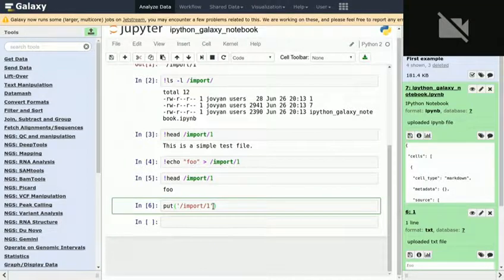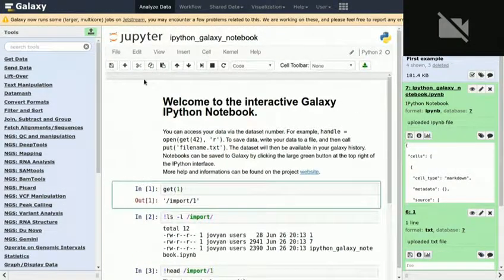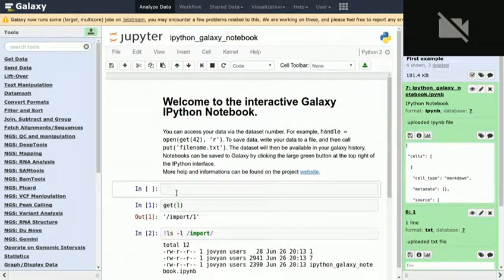Yes. So essentially what we recommend is annotate your file. What we are actually doing in Freiburg is something like that. At the top of your file, you create such a cell. You specify, hey, it's not code, it's now markdown.